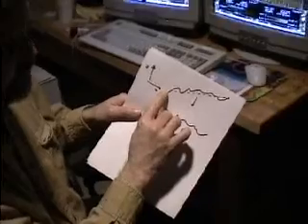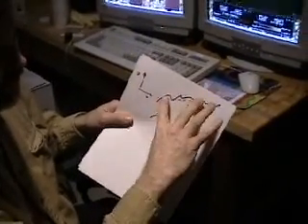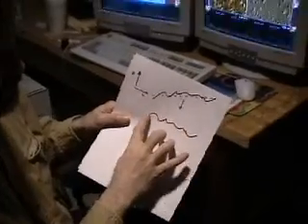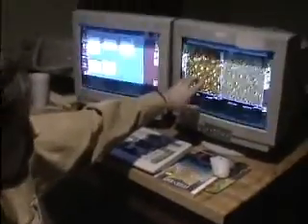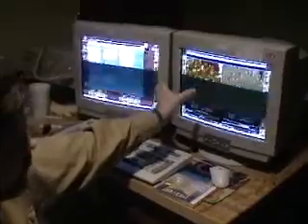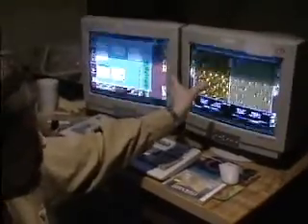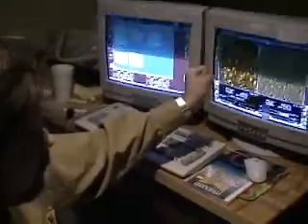The computer, for this one line of data, finds the best fit straight line through the data and compensates for that slope to show the data being flat here. And that's what you're seeing on the screen here. So every line is adjusted to have zero average slope, and every line is also adjusted to have the same average value for the line.